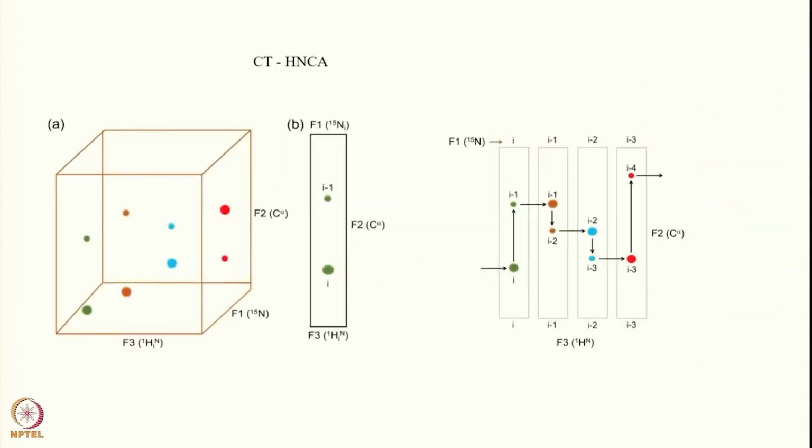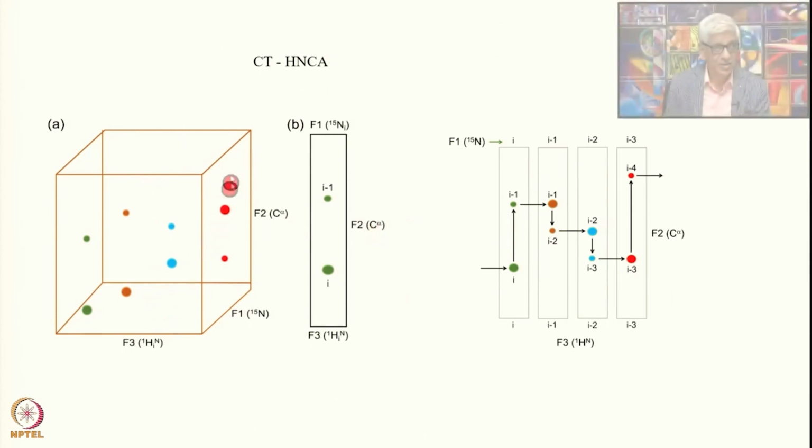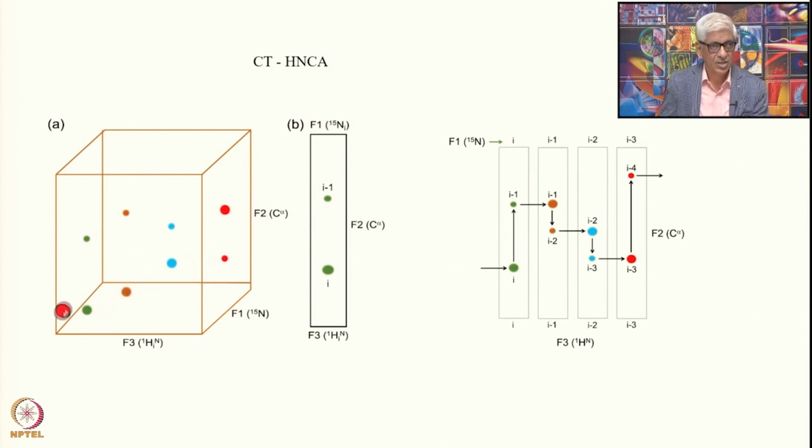Now let us look at this spectrum, how does it look? Here you have the schematic spectrum of a particular sequence, where some 4 amino acids are taken randomly. How many amino acids are taken here? There is one green, one red, then the cyan, and then another red here, and this is brown. Each one of them has a strong peak here and also a peak at this point. As I mentioned earlier, you generate the self peak as well as the sequential peak, and this is called the sequential peak of residue I minus 1.